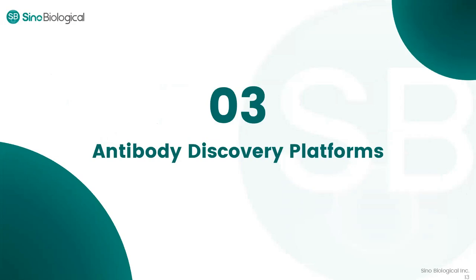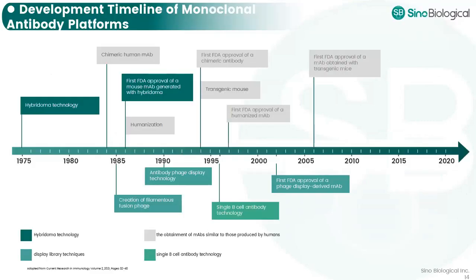Then let's move to the third part, the antibody discovery platforms. This slide shows the timeline of important events in therapeutic antibody generation, including the major antibody discovery platforms. We see that both hybridoma and phage display technologies have been used for antibody generation for therapeutic use. For single B-cell antibody techniques, which were discovered in the 1990s, we are still waiting for antibodies approved for therapeutic use.